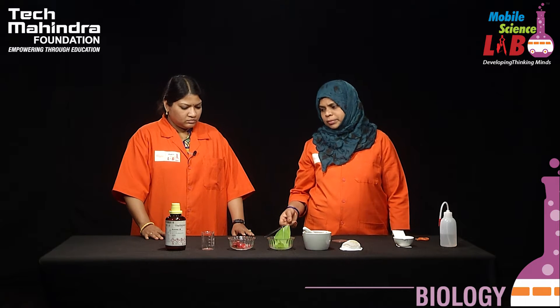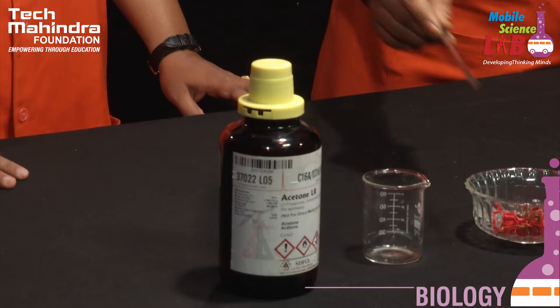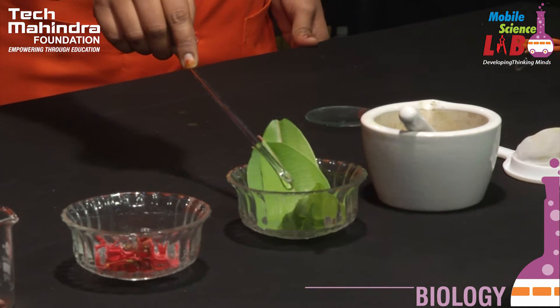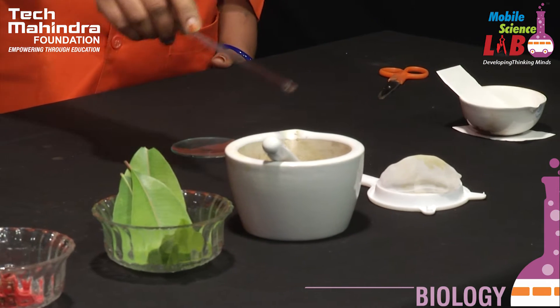The apparatus and chemicals required for this experiment are: acetone, colorful flowers, leaves, mortar and pestle, and a strainer.